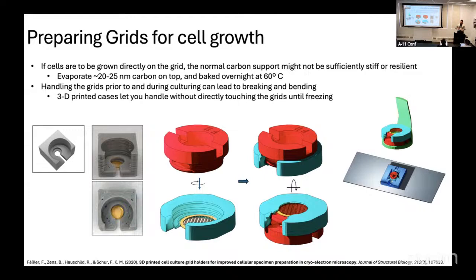holder I glue down to a cover slip, and I Primo pattern on that. And this is the case that I use to get it out. It positions it correctly to get tweezers in. I can unscrew it and take it out.